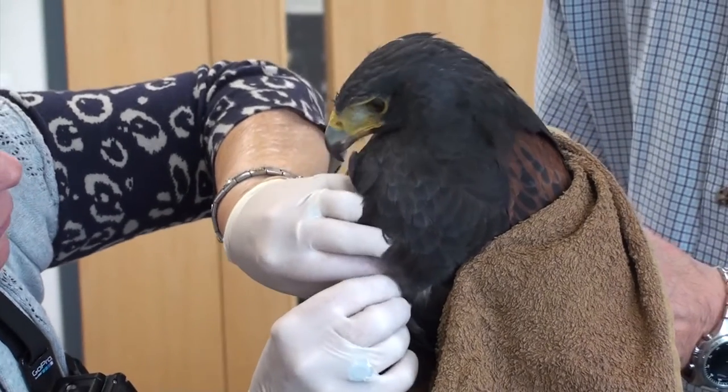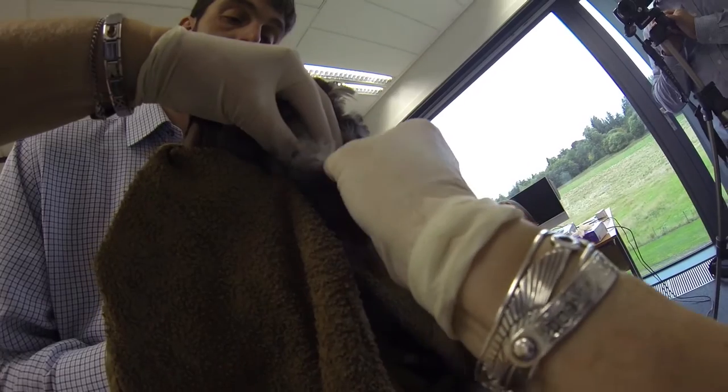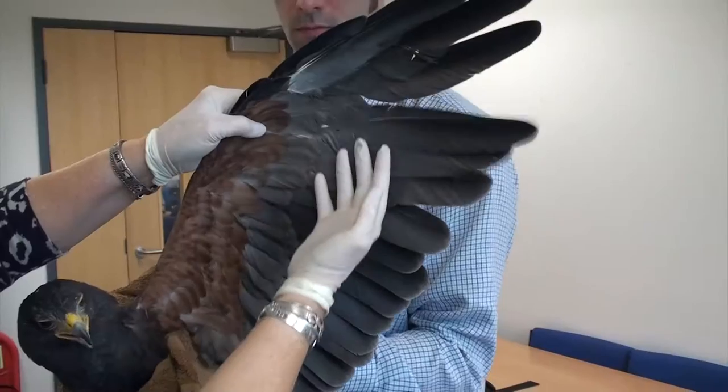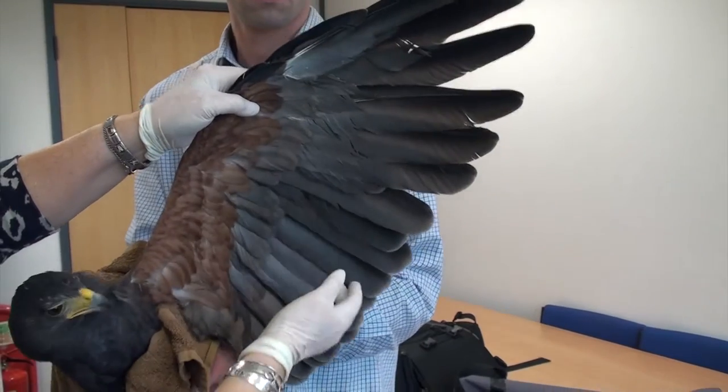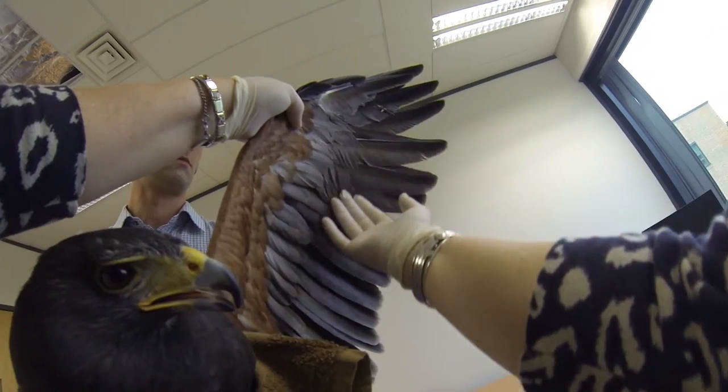Wearing gloves if possible, pluck out at least three newly emerging larger feathers. The following feathers are not suitable: mature feathers which are ready to fall out or have already fallen out, as the DNA may not be of suitable quality; and cut feathers, as the feather tip contains the DNA.